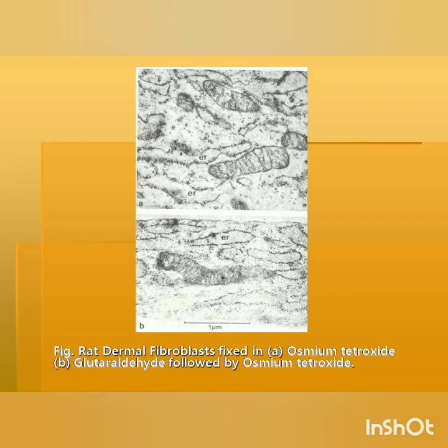In addition to glutaraldehyde and other fixatives, different types of fixatives can be used for different purposes in transmission electron microscopy.